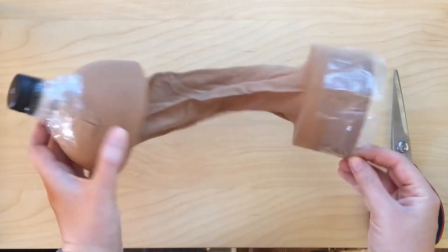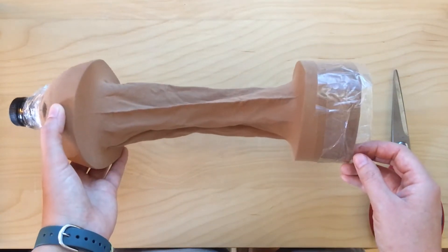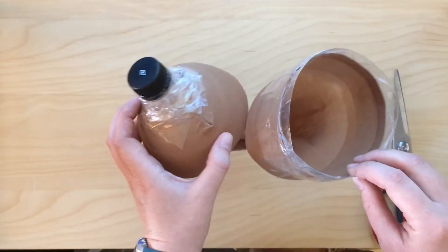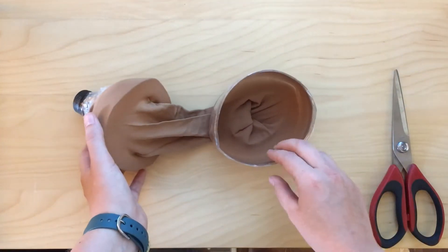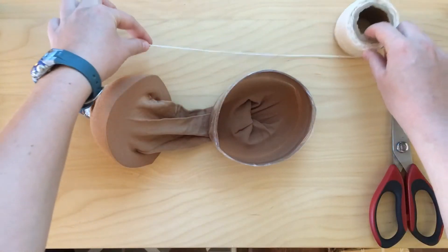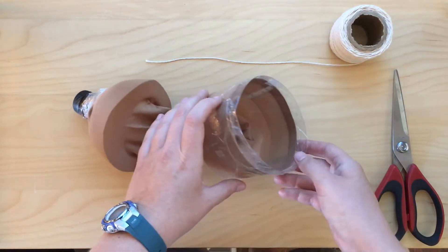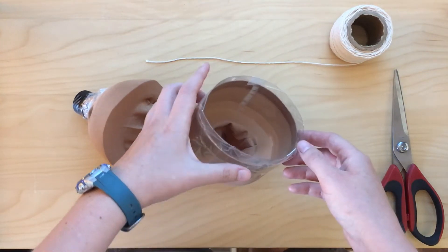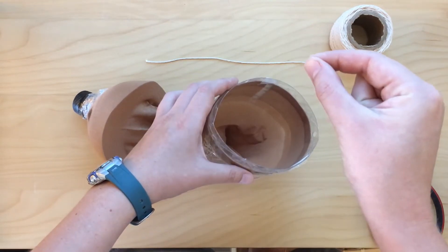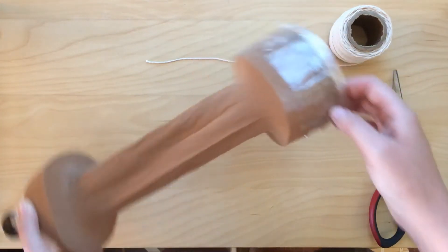This is our plankton net. Now that you have your net you need a way to drag it through the water. You can either wade out into the water and pull it along with your hands or you can attach a tow rope to it — I suggest attaching a tow rope. You'll need string and scissors, and first we're going to make a bridle, which means we're going to have a piece of string coming from each of the holes tied together so that it will drag straight through the water instead of at an angle.